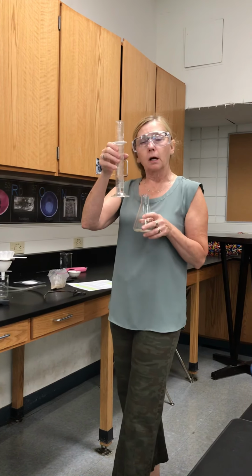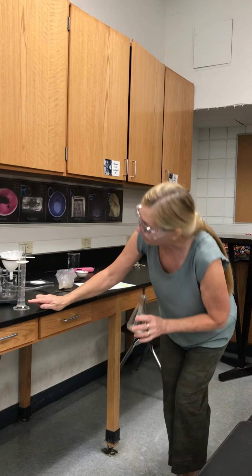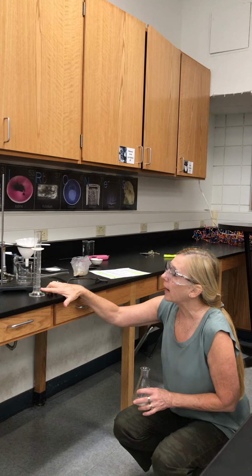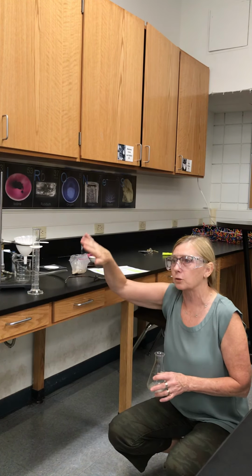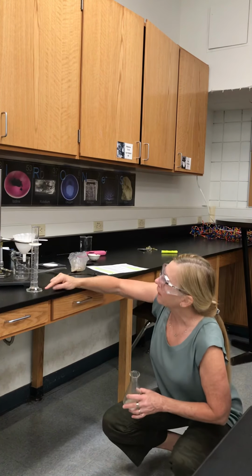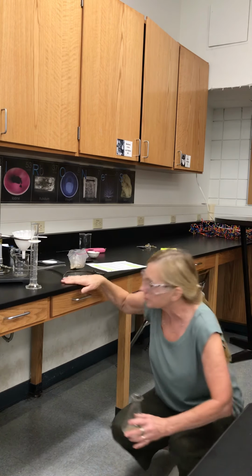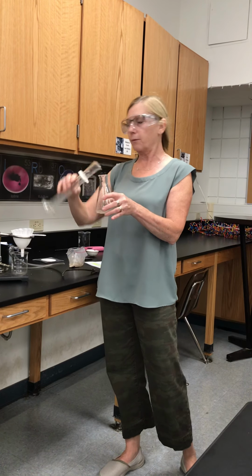When you're using a graduated cylinder and you're asked to put a specific amount in, you have to get down at eye level and look at the line where 10 is. You have to look at the meniscus, the bottom of the water. The surface of the water actually dips down due to gravity, so you'll have to look underneath to get an accurate measurement, not just the edge of the water, but where the bottom of that disc shape goes. I've already done that, so I'm going to pour it into my Erlenmeyer flask.